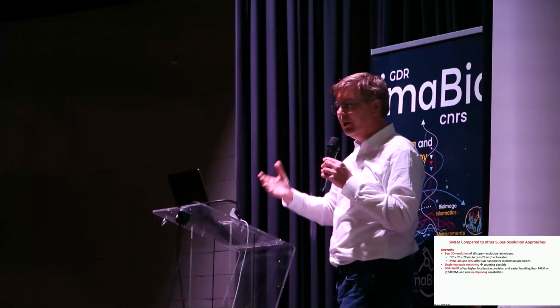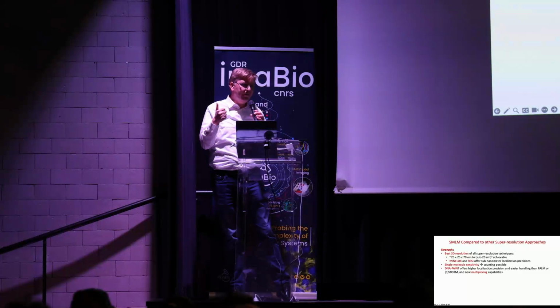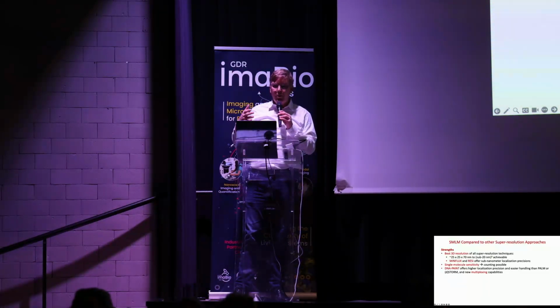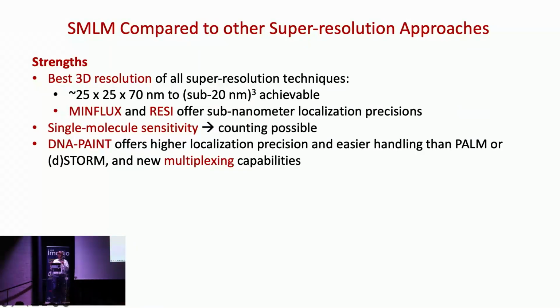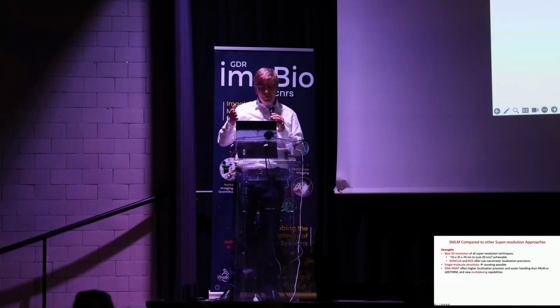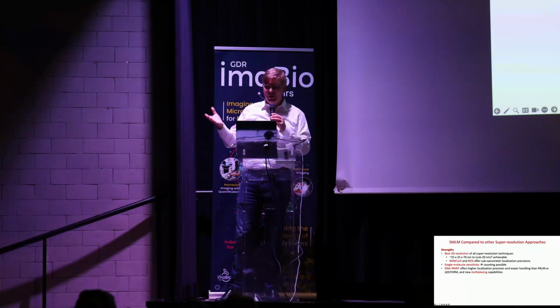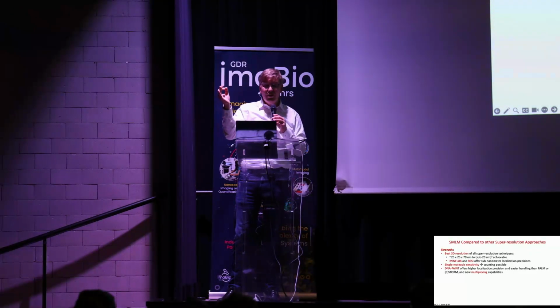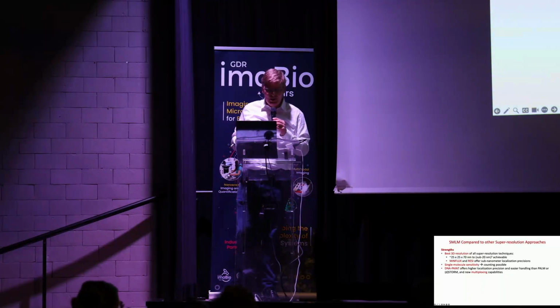So in summary, let me just summarize this and contrast this maybe to other super resolution approaches. The strength of single molecule localization microscopy, I would argue, is that it still is the technique with the best 3D resolution in particular. STED and structured illumination microscopy will normally not achieve these 3D resolution levels. We'll hear from Francisco in a second about MINFLUX, which is also a single molecule localization microscopy technique, I would argue, where the resolution gets down to sub-nanometer precision. So there's really no end to the resolution you can get with these techniques.